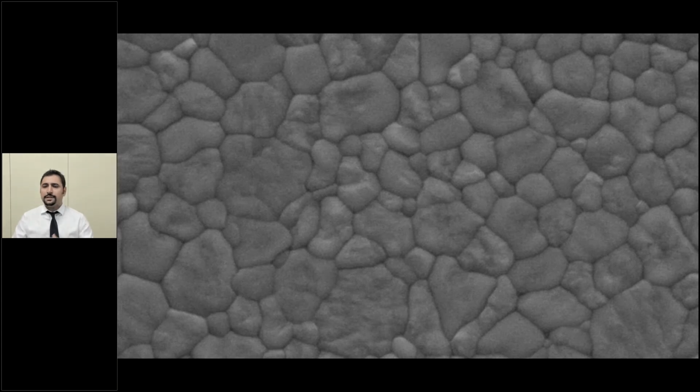Now, we talked about tetragonal and cubic phase. And we always hear about the self-healing properties of zirconia. Let's see how that translates into how these zirconias behave. So this is an SEM image of zirconia.